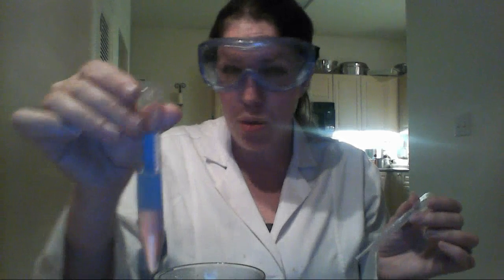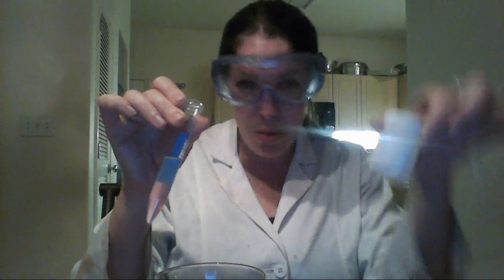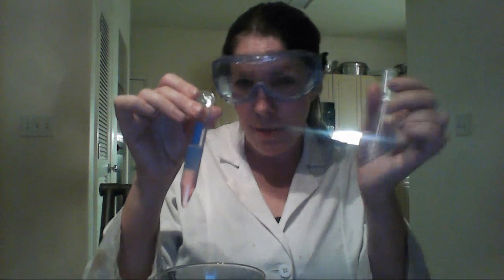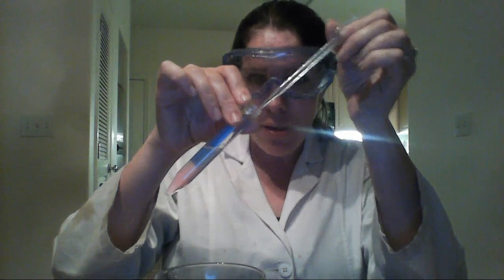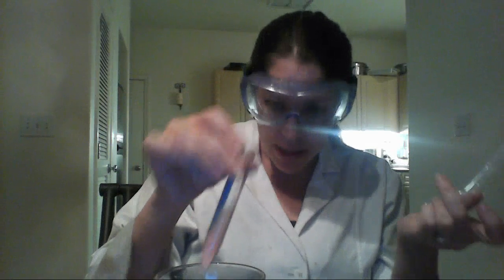Okay, you're going to need your pipette again. And the trick here is we're going to have to take our tube that holds our cheek cells and turn it at a 45-degree angle with one hand. And you're going to end up using about 13 or so milliliters, just enough to basically fill this until you get enough precipitation. And you're going to want to take your strong hand, I'm a lefty, so I'm going to hold it here, and take that ethanol and you're going to very slowly drizzle it down the side of the tube, holding this at a 45-degree angle. So the technique is actually really important. That's going to make a difference.